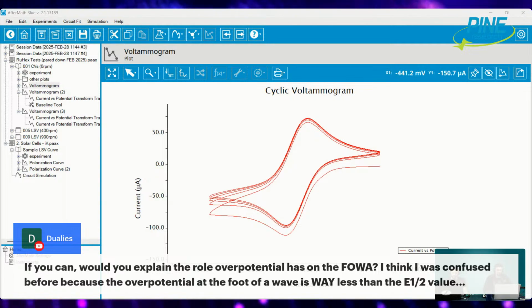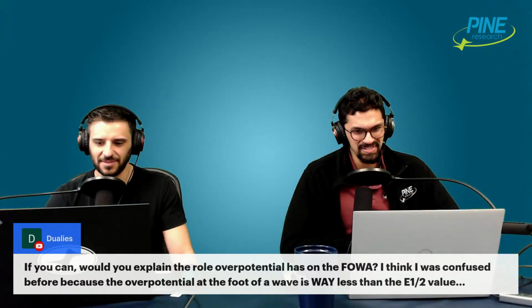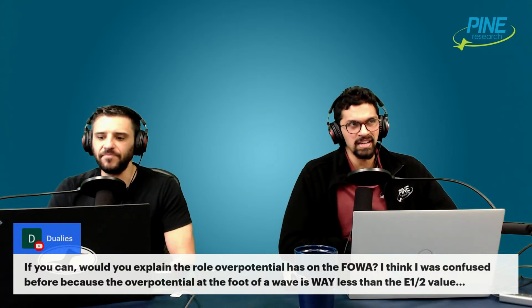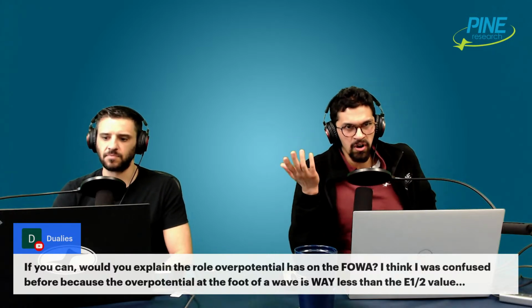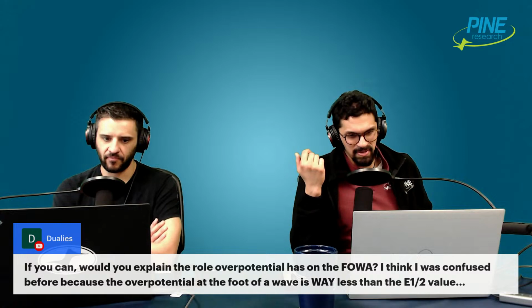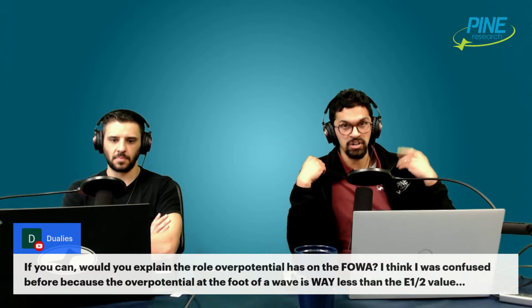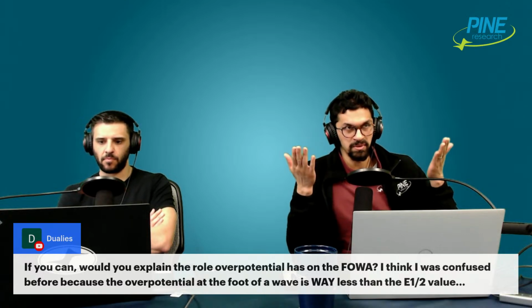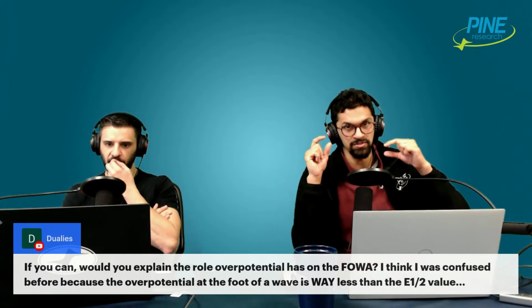Yeah. Oh, it just goes back to the Nernst equation. It's always the Nernst equation. So this question is, why is there any current flowing at all? The Butler-Volmer equation describes the change in the concentration at different potentials. And current will flow, or if you want to think of it this way, you have the Nernst equation, and being at different potentials relates to a different ratio of concentrations.